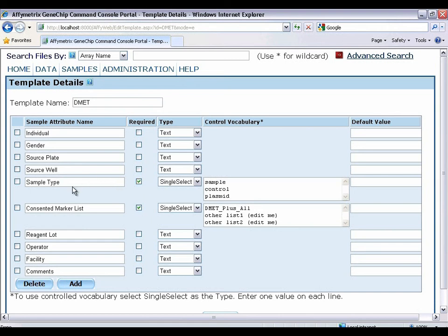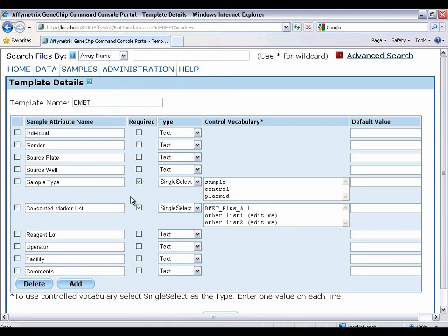The two required fields are sample type, to allow you to specify whether your sample is genomic material or non-genomic, for example plasmid. The other required field is consented marker list, which specifies which set of DMET plus markers should be genotyped. You can create your custom list that has to sync with what's in DMET console.